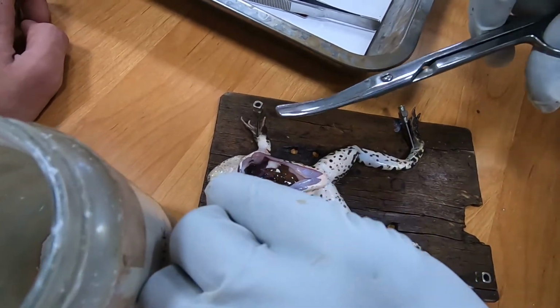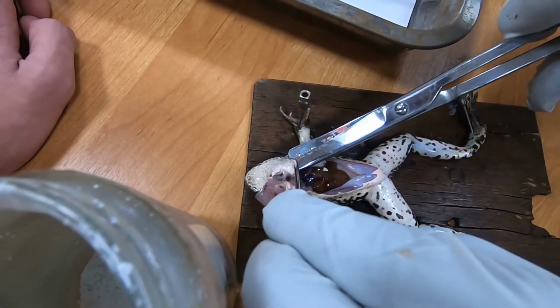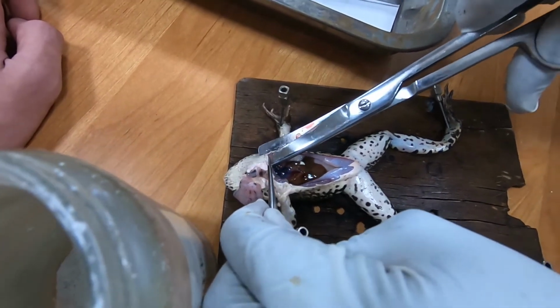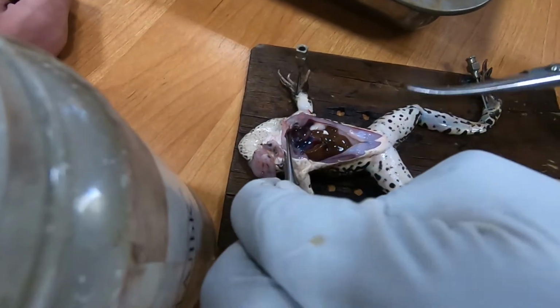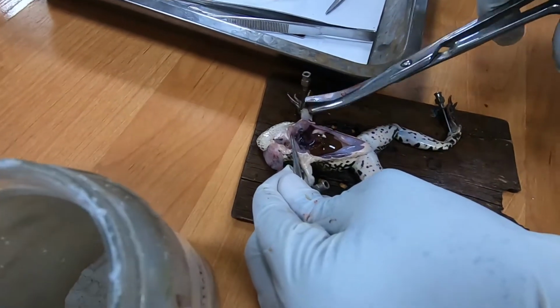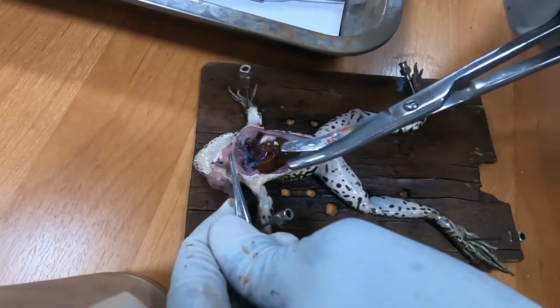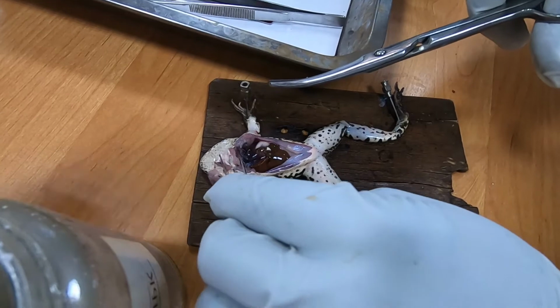Now we have exposed our heart again. And we're going to remove it like this.